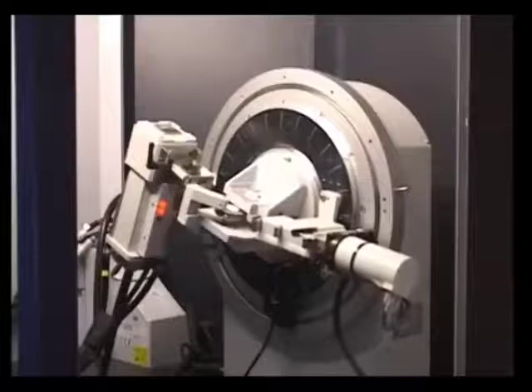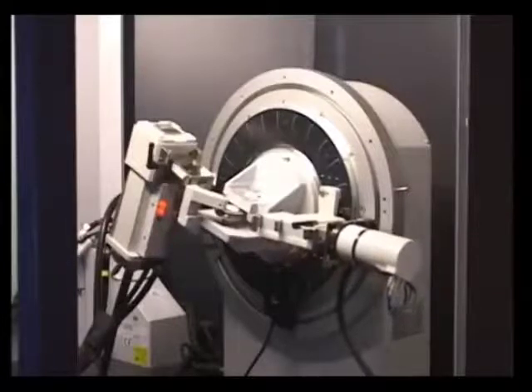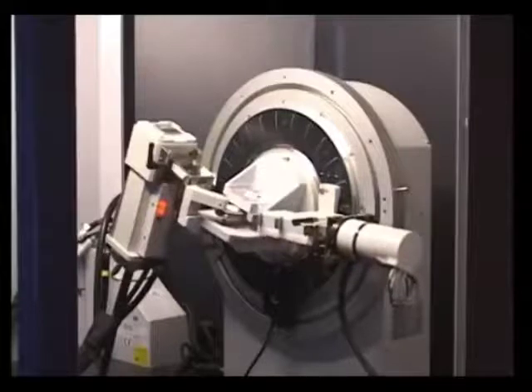The sample ID now is changed to demonstration. It's automatically loaded my start and stop and increment values, and it's running the scan. It moved the stage and the detector automatically, so everything is being done automatically. We can see there's a number of peaks already. This is alumina, which is a NIST standard.